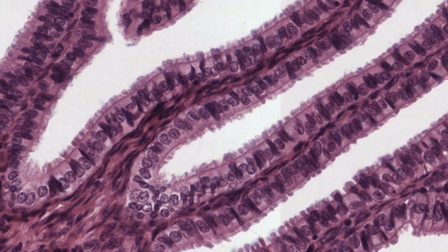So clearly, in its most active functional state, the epithelium of the uterine tube would best be defined as being simple columnar, as I said in my opening remark. Perhaps the image here is of the uterine tube collected when the epithelium was not at its peak functional state.